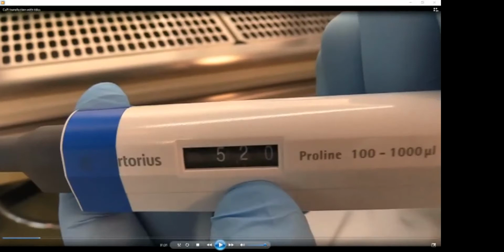This technique, if everything works well, is very sensitive, and there are quite large differences between individual samples. For that reason, we always use triplicates, and then for the final evaluation of the results, we calculate the mean and standard deviation.